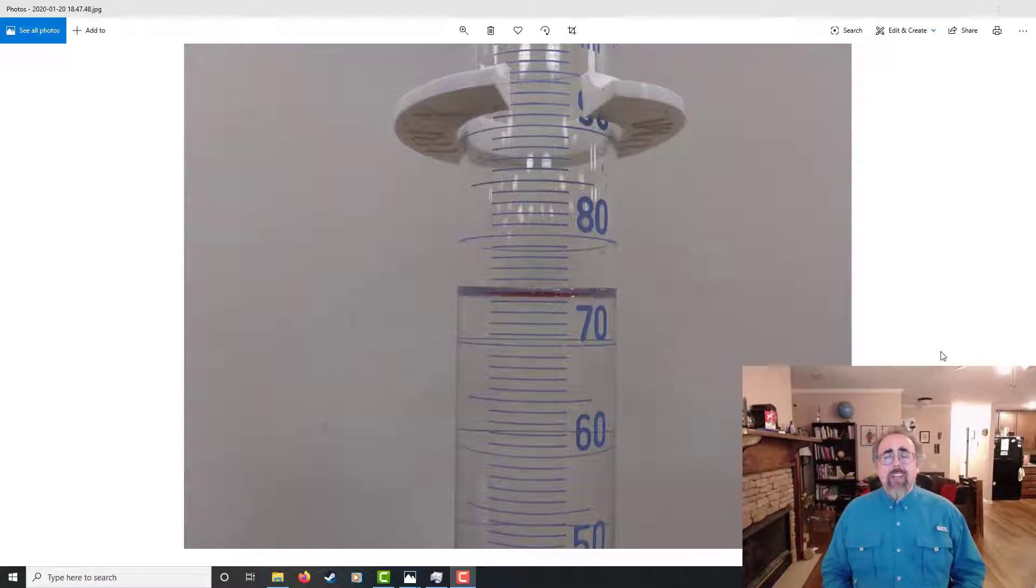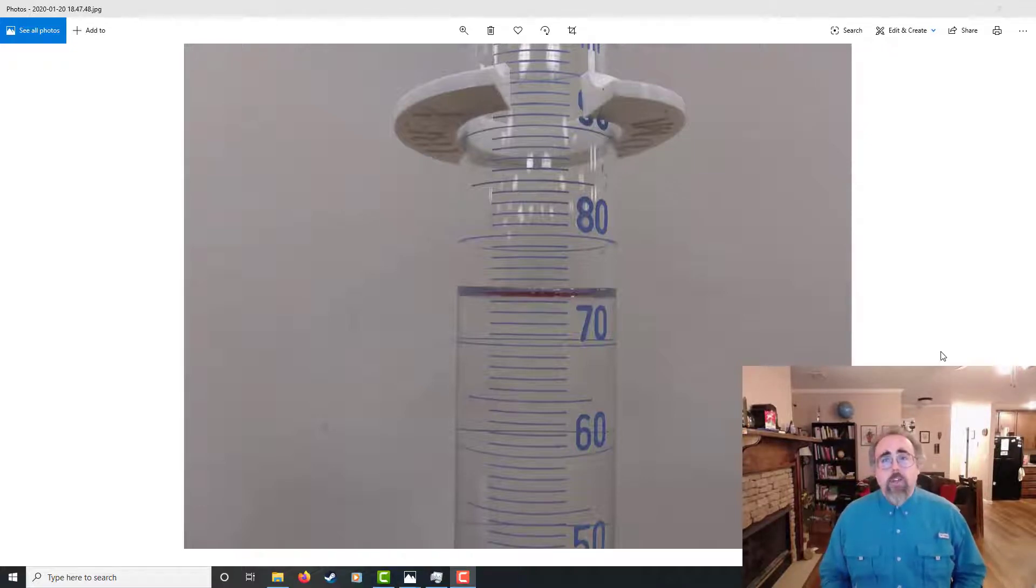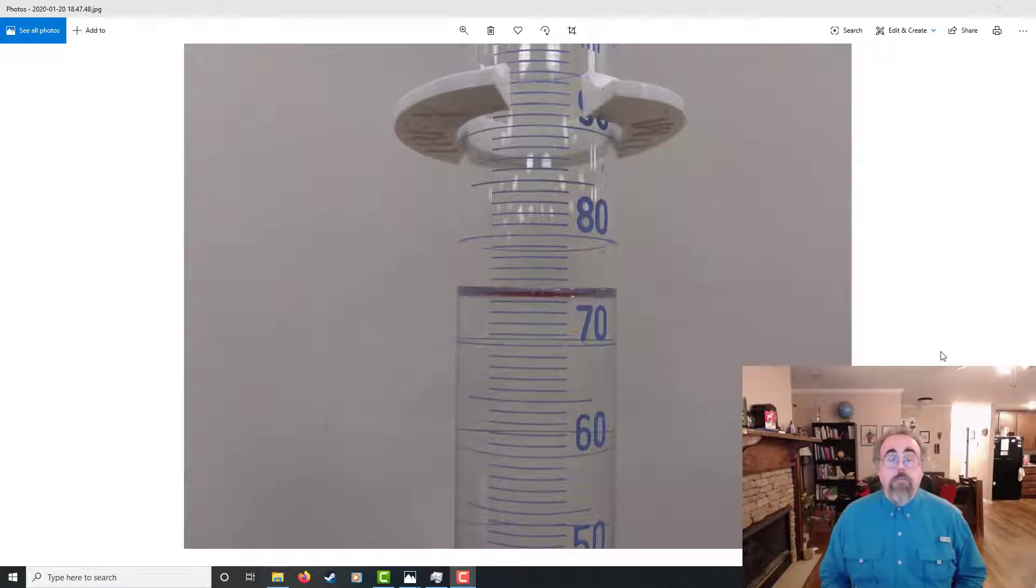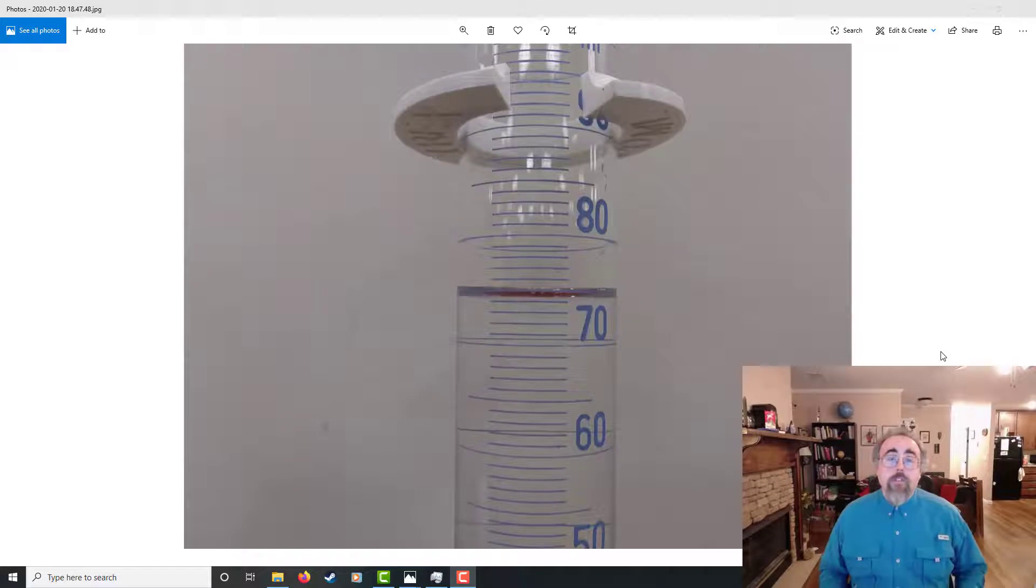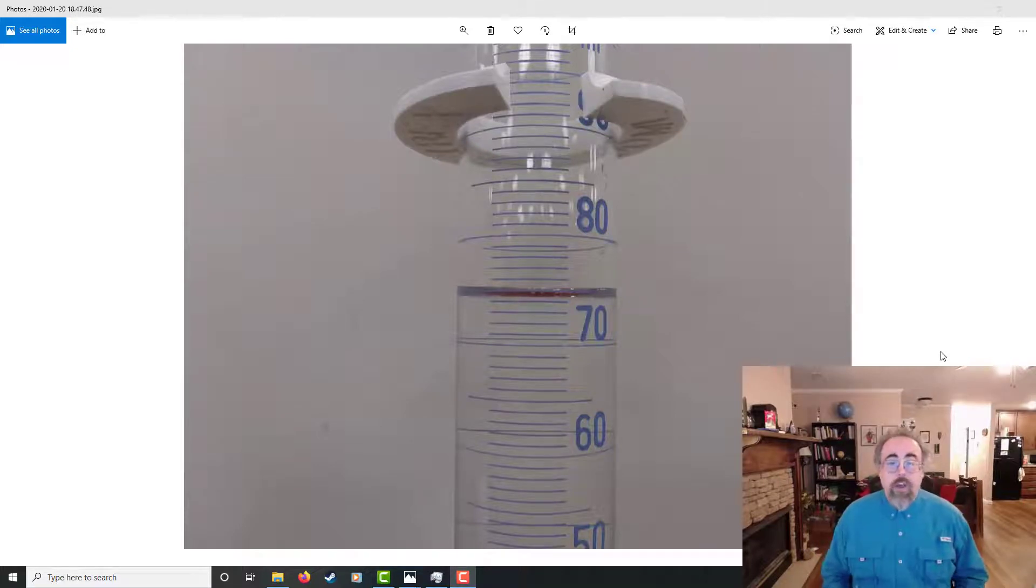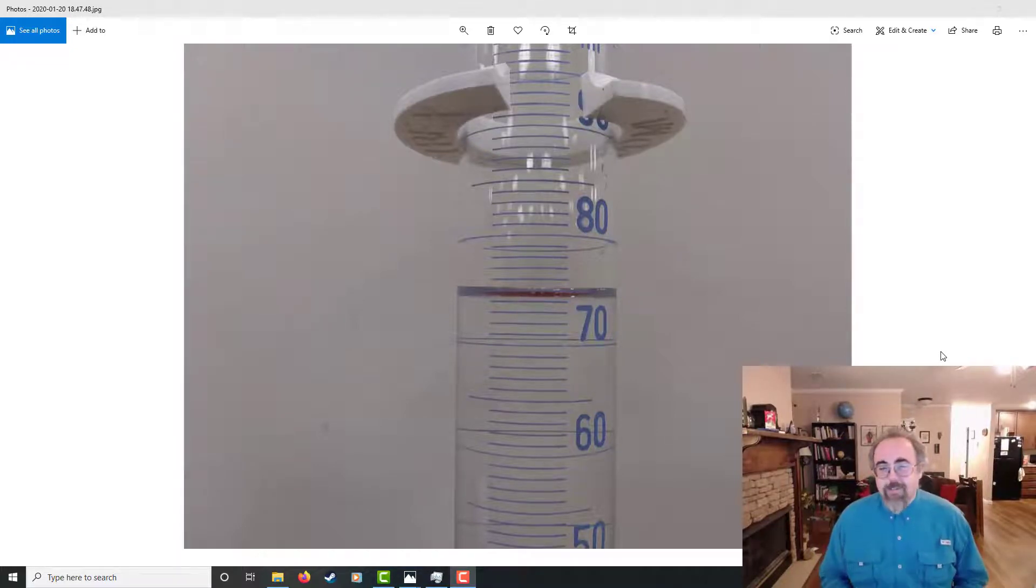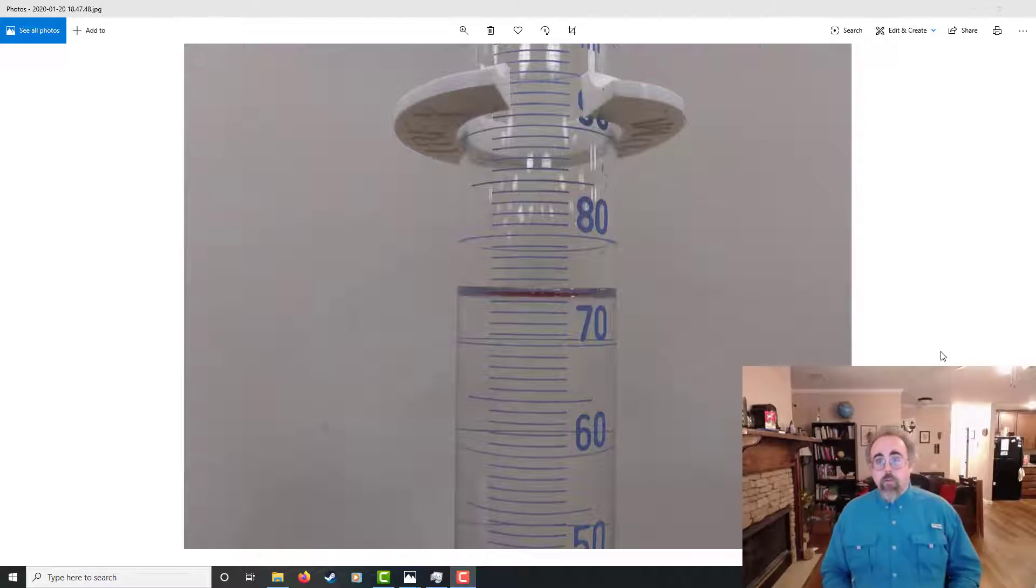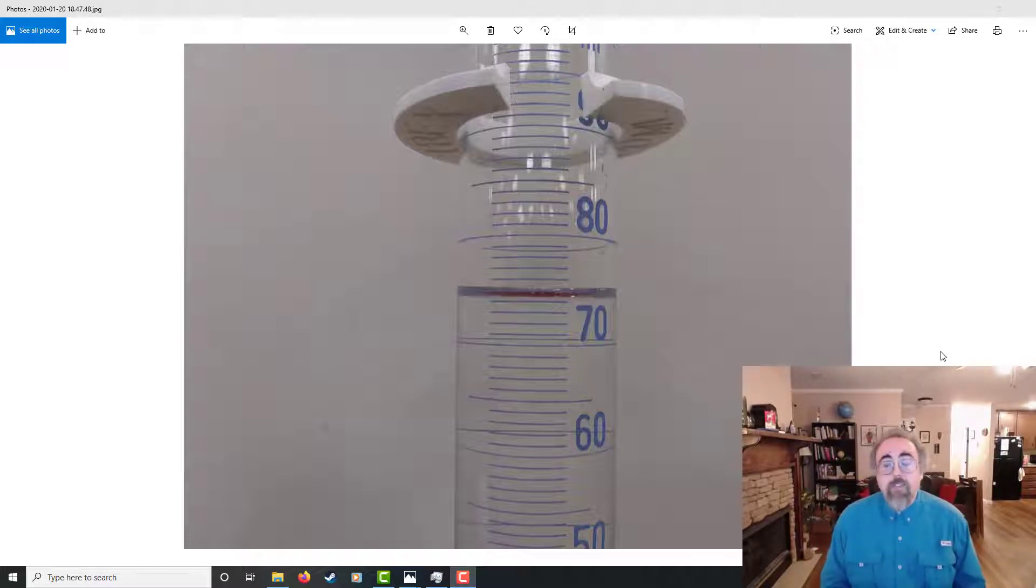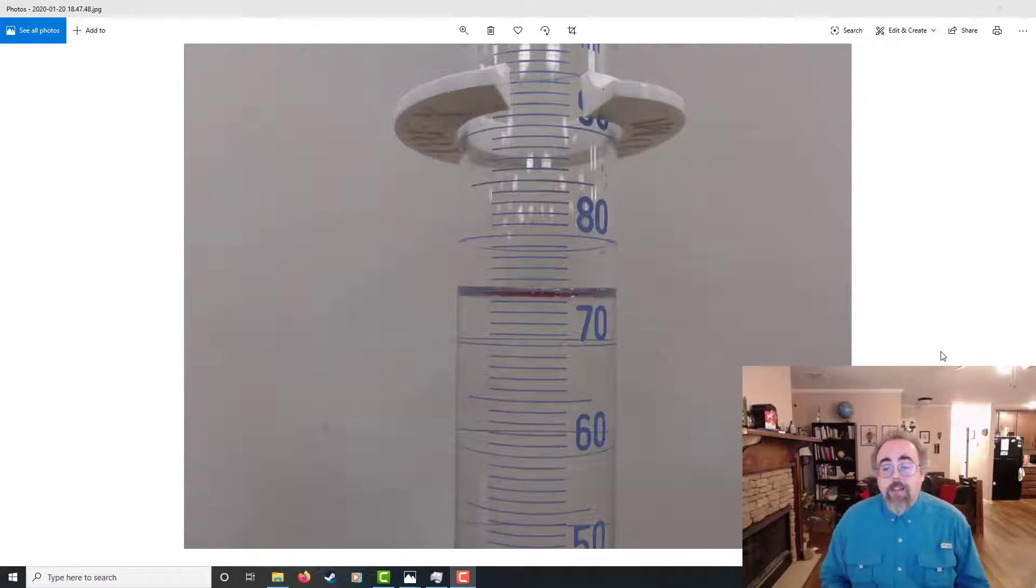This applies not just to graduated cylinders, but other glassware with marks for volume. So things like beakers, although you never really trust the marks on a beaker, or even volumetric flasks, which all have one mark. So some things I'm going to say don't apply to them because it's literally only the one mark. But this is going to be for graduated glassware.